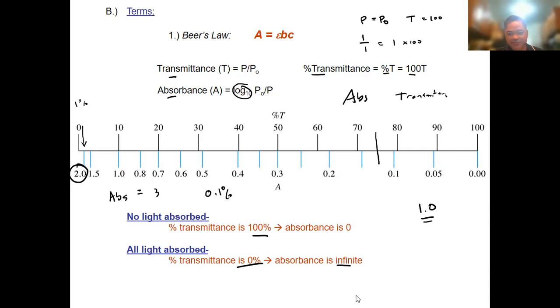the idea is you have to set the absorbance maximum equal to 1. The main explanation is that at 1, at least there's still 10% of light being transmitted. So when it goes higher, it becomes only 1%. If you make it 3, it becomes only 0.1%. So you lose a factor of 10 for every absorbance unit. Okay? Difference of 1, 2, and 3. Maybe you have learned the main reason why we have to make it equal to 1.